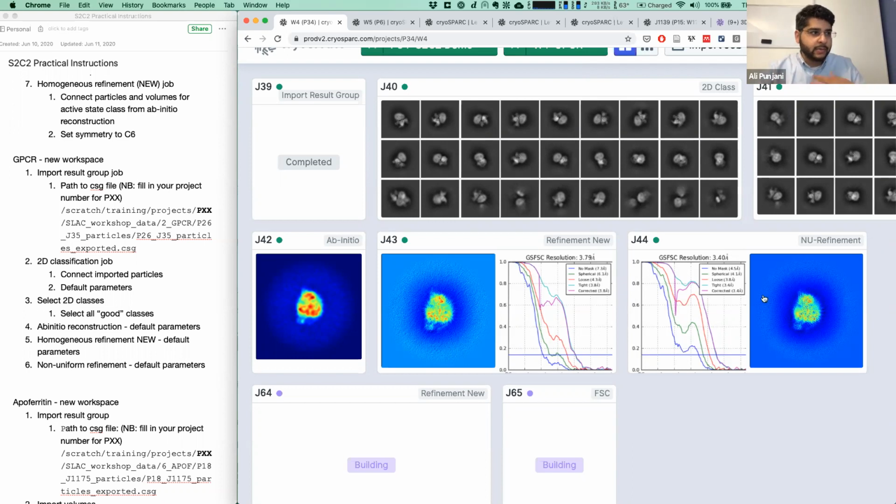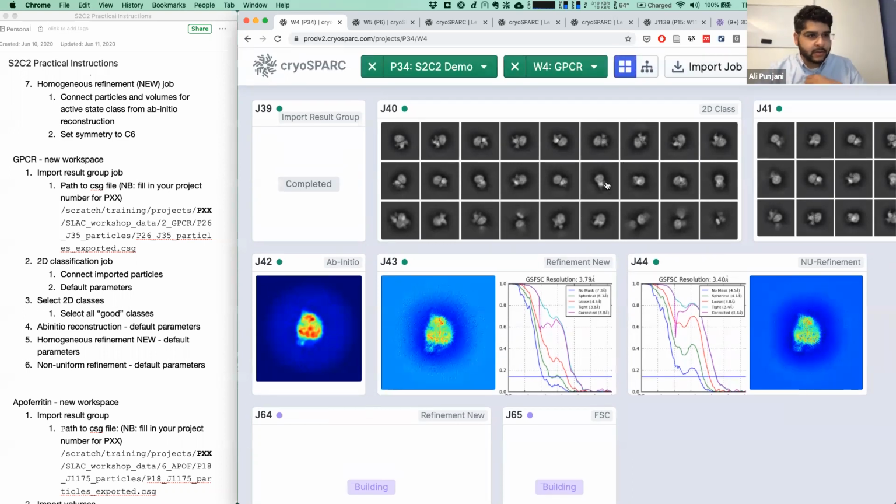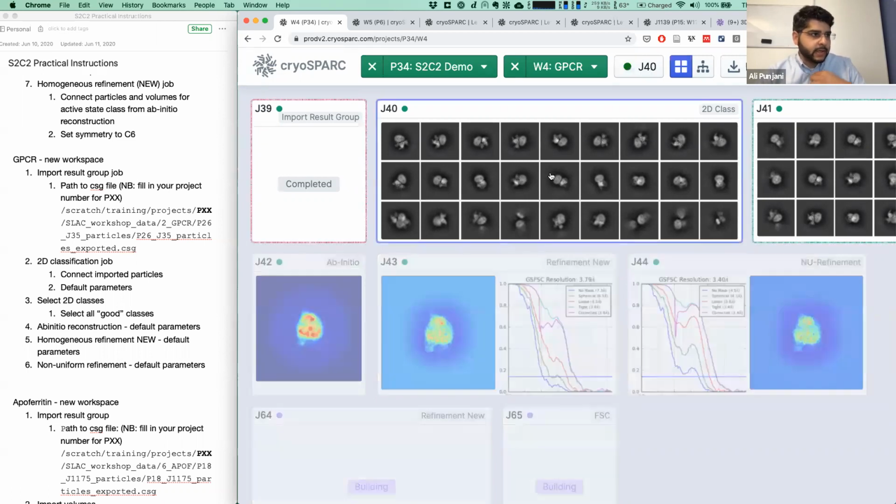So far, we don't really have any indication or suspect that there are conformational states that we really want to investigate at this point. So we're not worried about that right now. We'll find out later that was actually not a good assumption, but so far we don't really detect anything that hints that there are multiple conformational states that we're looking at.